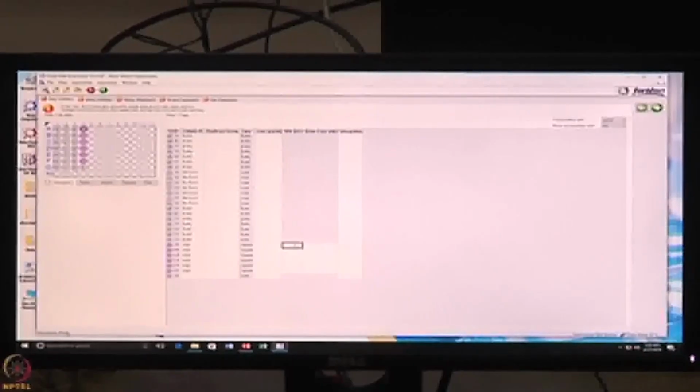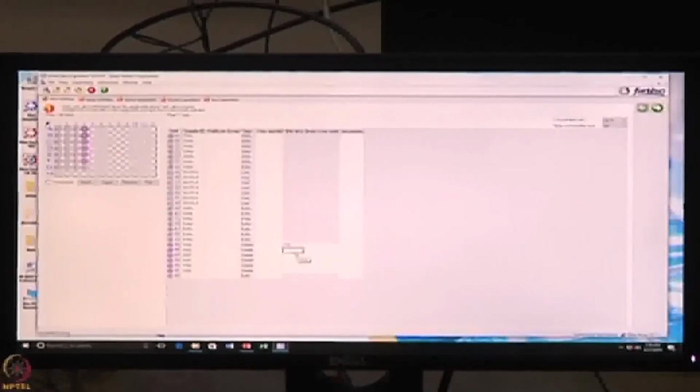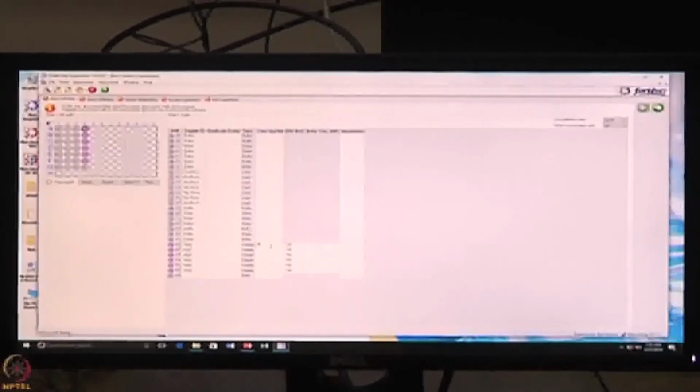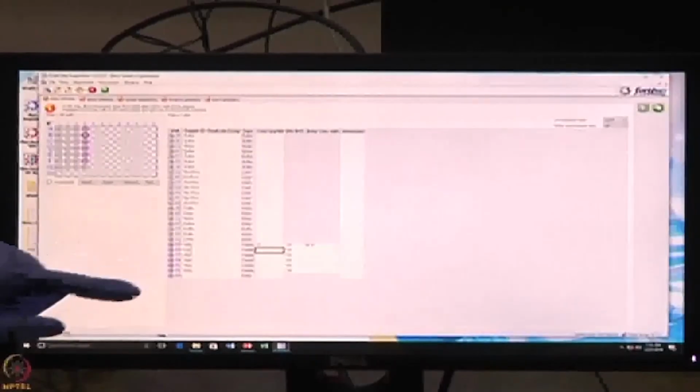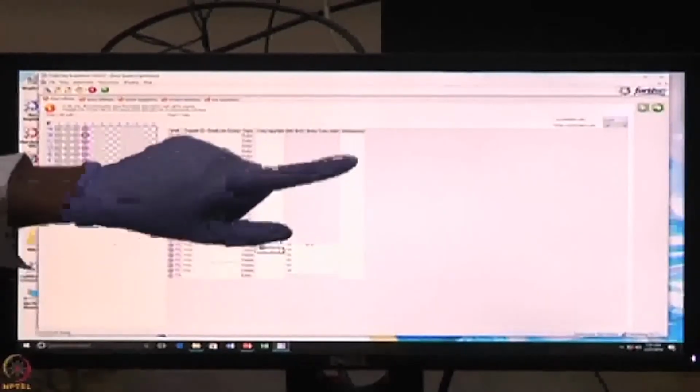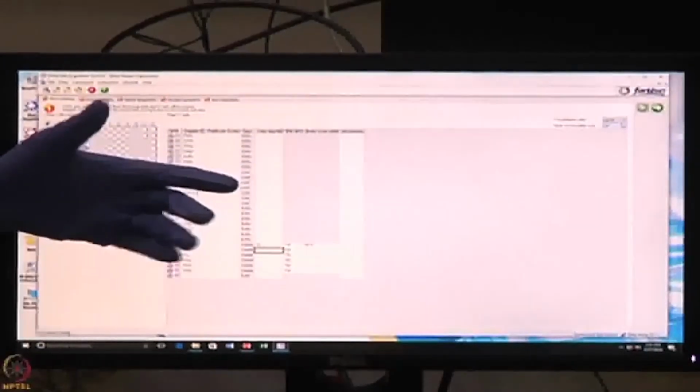The general IgG molecular weight is 150 kilodalton, so we have to feed 150 kilodalton here as the molecular weight. Then Control C, once again you require all the parameters. My starting, top concentration is 10 microgram per ml. If I type 10 microgram per ml, the software lets you change the concentration unit, like microgram per ml, mg per ml, or anything.